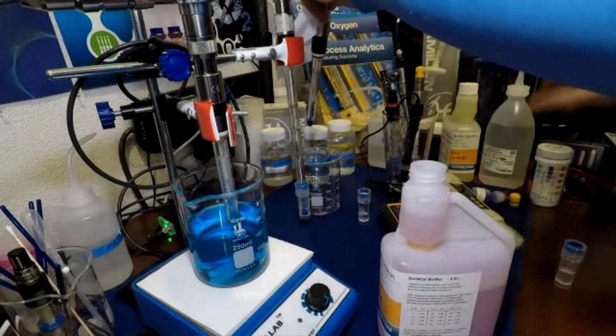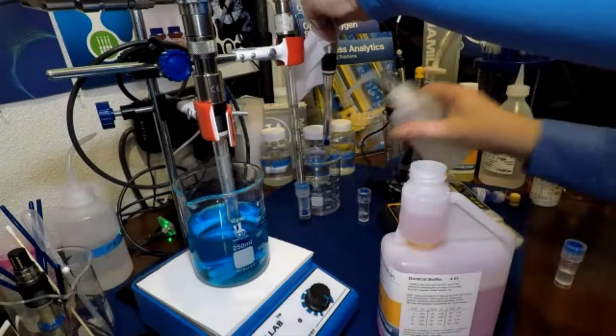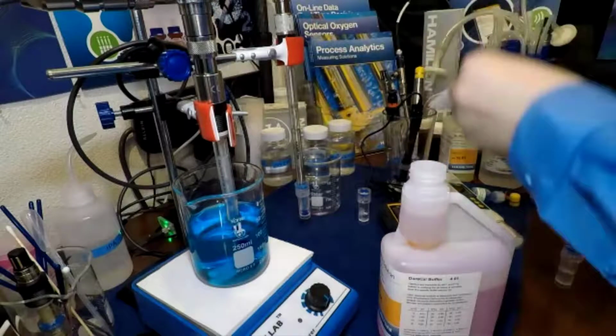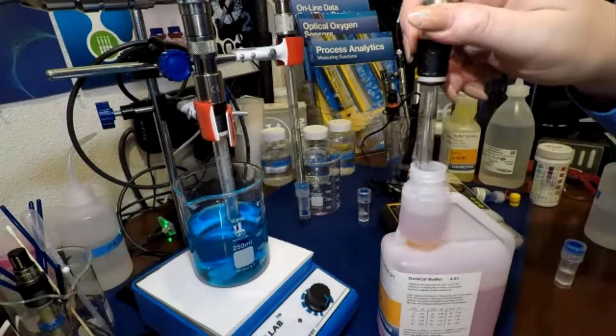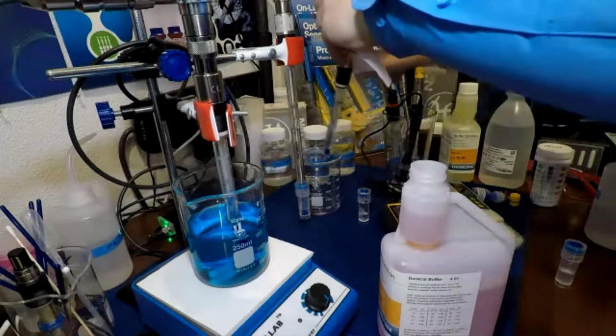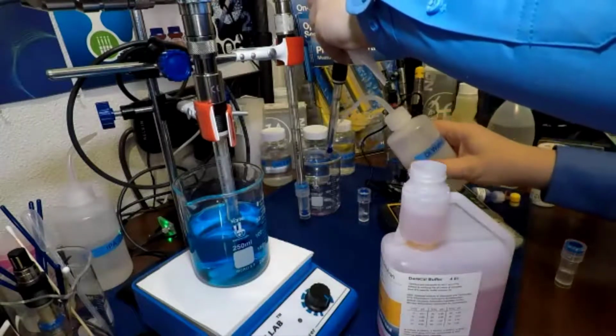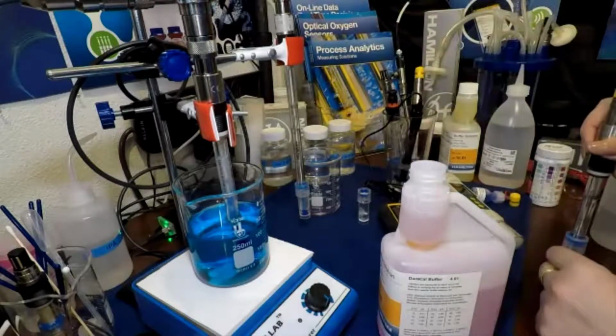When I'm measuring with fresh buffer, I should always rinse my probe before going from one bottle to the next, and blot and then put it in. And here's my buffer. When I'm done with that, I rinse, I blot, I put my probe away.